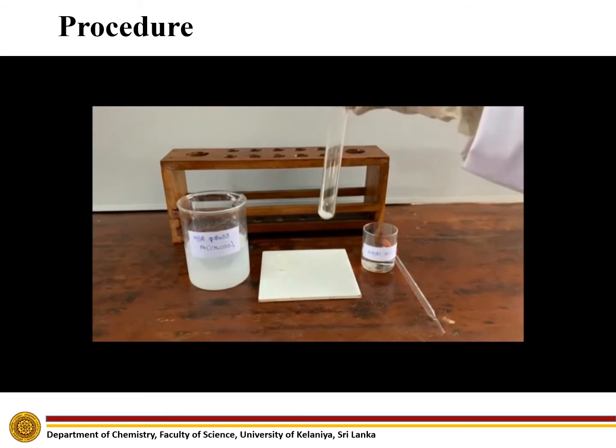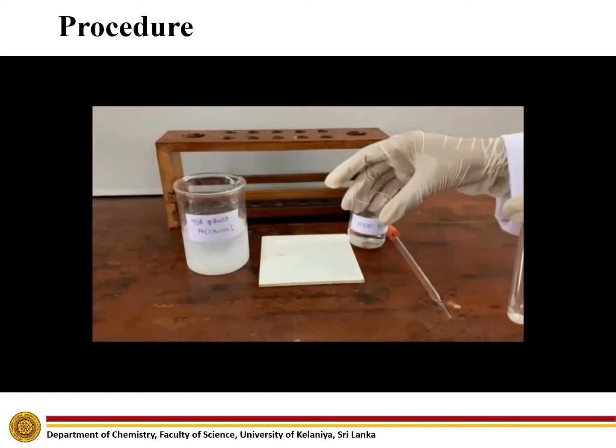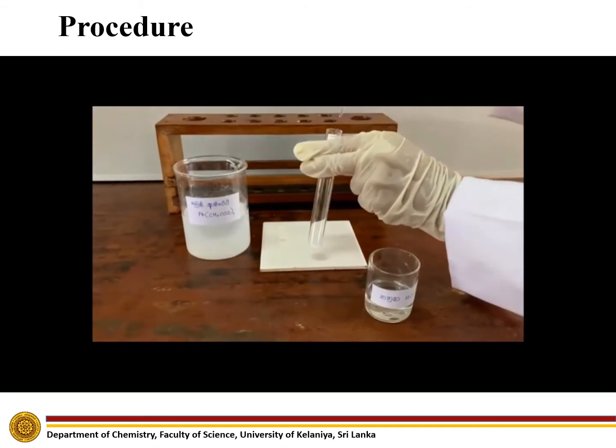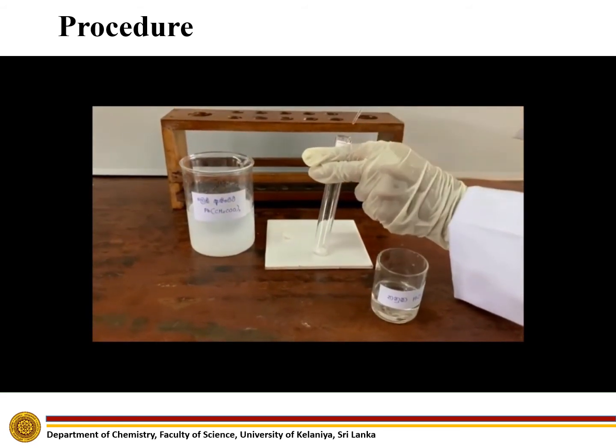In the next part of the experiment, you have been given a powder of sulfide ions. Add dilute hydrochloric acid to the given powder.